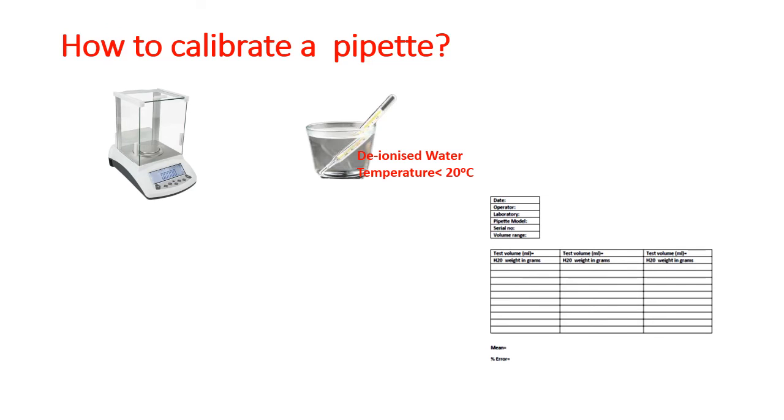Now, what we have to do? Suppose we want to calibrate a pipette at 500 microliters. We have to take a sterile volumetric flask, put it inside the weighing balance and it will display the weight of the empty volumetric flask. Then we have to nullify the weight of the volumetric flask. It will turn down to zero. Then suppose we want to calibrate the volume at 500 microliters. We have to aspirate 500 microliters of deionized water, put it inside the volumetric flask in the weighing balance and it will display some weight. We have to note the weight here and again we have to set it to zero. We have to repeat this process for minimum of 10 times, calculate the mean and see the percentage of error. If it is within acceptable limit, that means our pipette is calibrated.